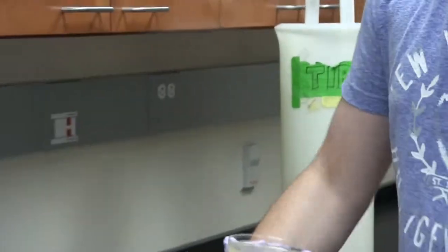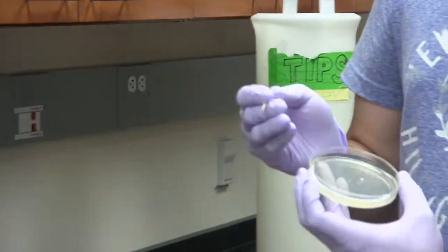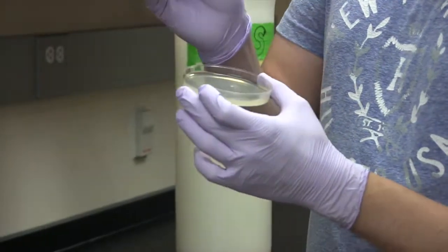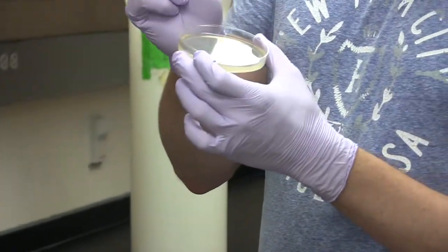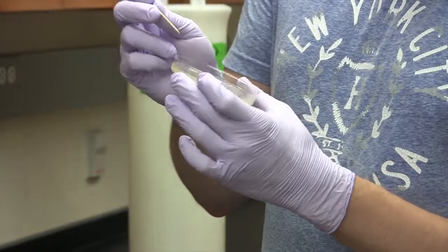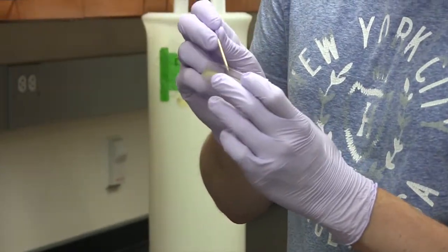And the key here is to find a colony that is well separated, and also you only need to touch the very tip of the colony with the tip of this toothpick. You don't need to just scoop out the whole colony.